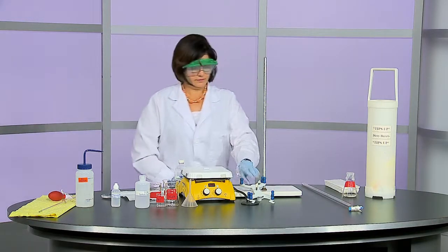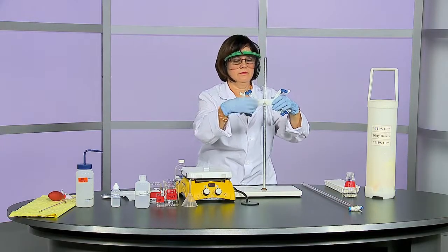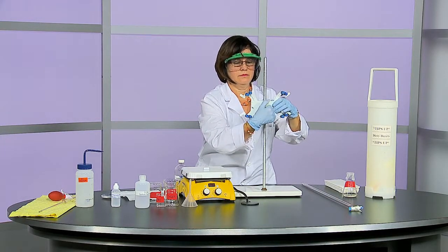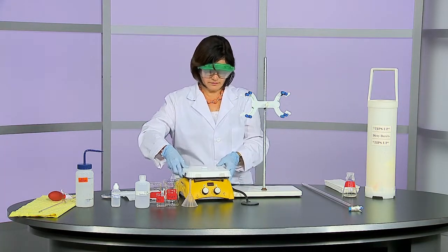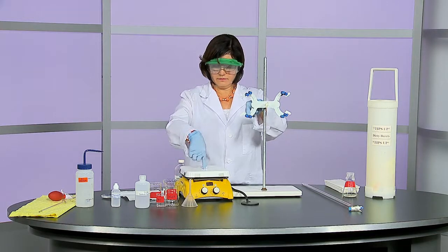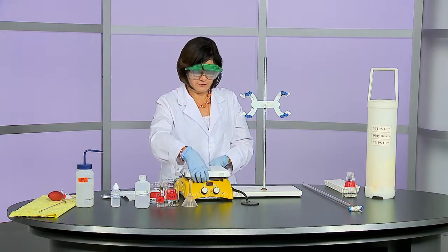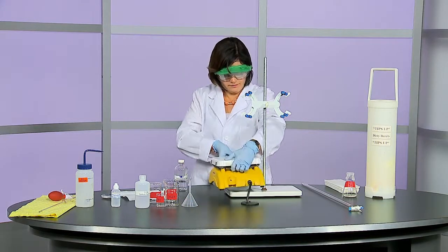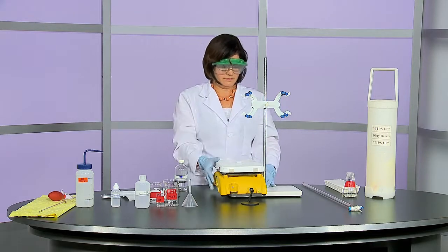Place the burette clamp on the stand. If the electric stirrer is small, place it next to the stand and rotate the clamp so that it is over the center of the stirrer. If the electric stirrer is big and the clamp cannot be positioned close to the center of the stirrer, place it on top of the stand. Shift it around until it is stable.